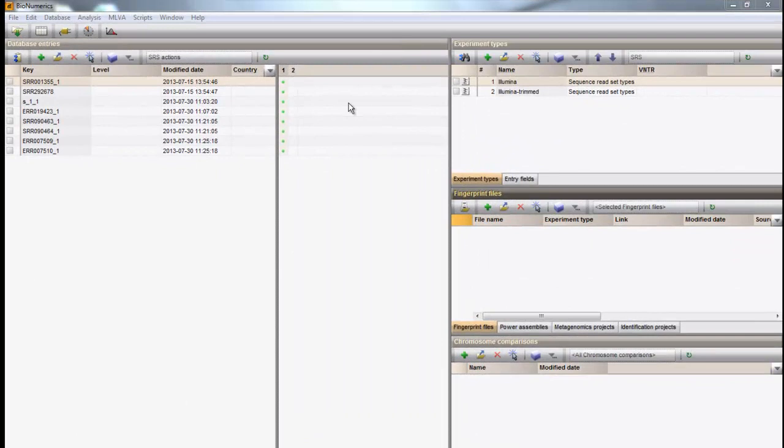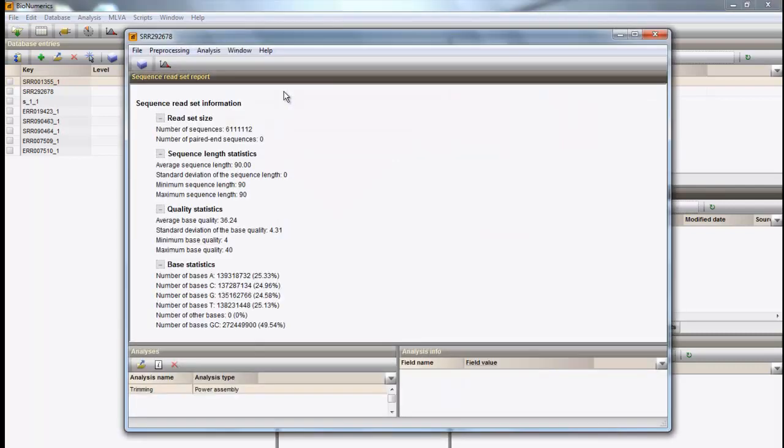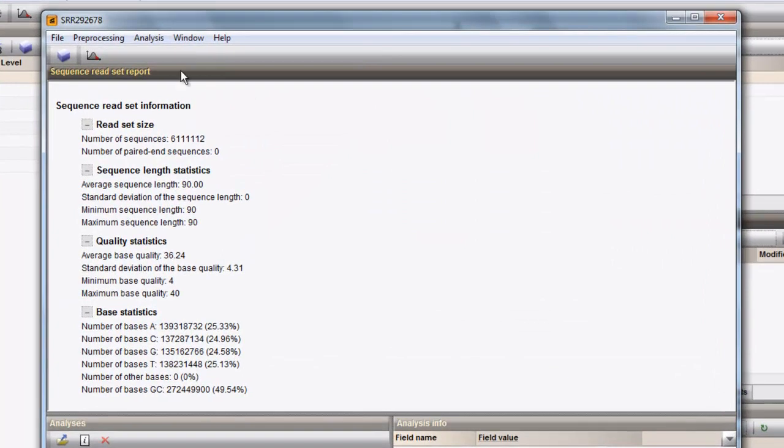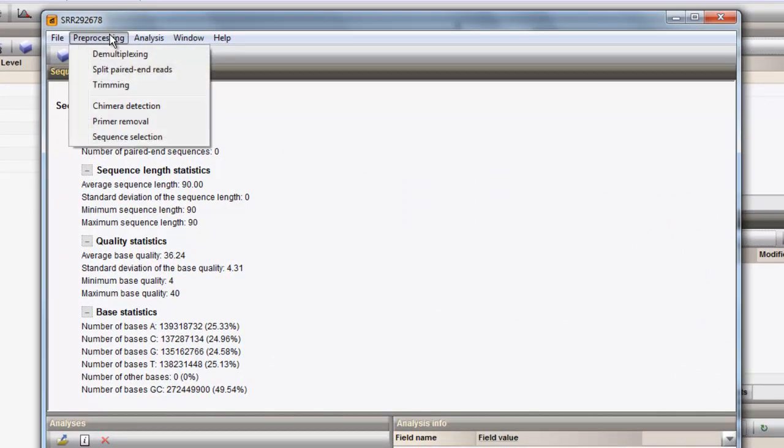In this video, we will start preprocessing runs in Bionumerics. From the Sequence Read Set experiment card, one can easily launch a specific preprocessing action on the data.